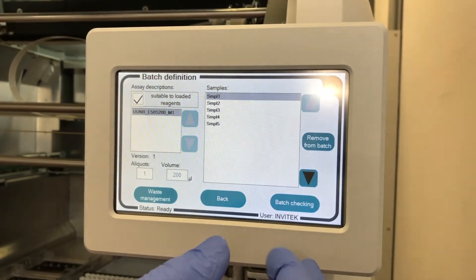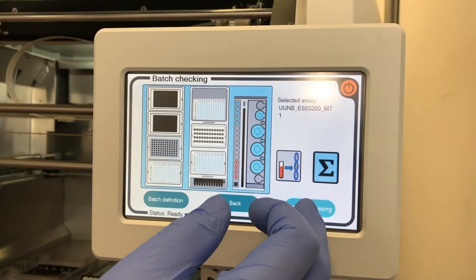Do a final batch checking and start the run.